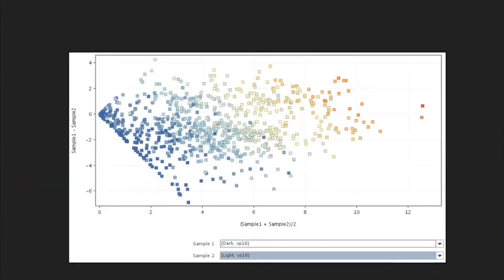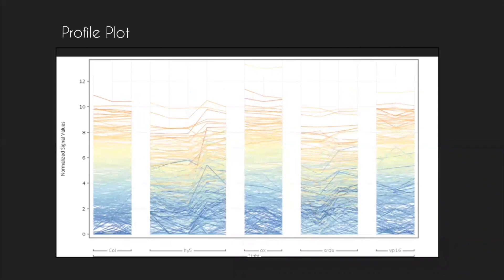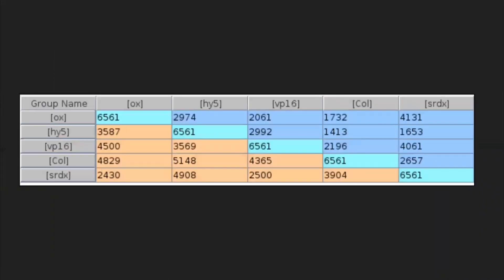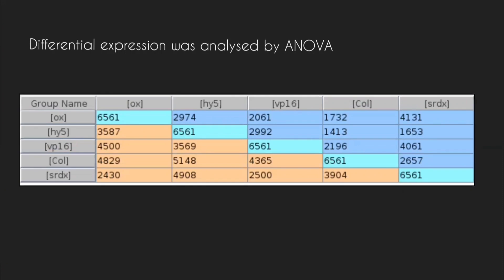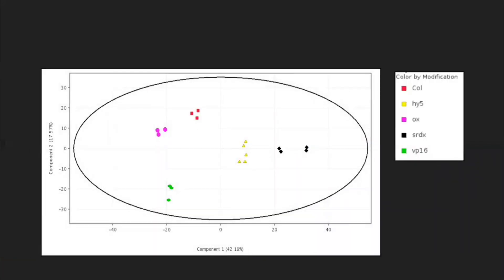Now we can visualize the gene expression of all genes in all samples by various plots — here is a scatter plot between two samples: dark-exposed and light-exposed plants with HY5 VP16, a box-whisker plot of samples, and a profile plot. Differential expression was analyzed by ANOVA; all conditions are compared to the HY5 mutant. 6,561 genes were found to be differentially expressed. A PCA and hierarchical clustering were done based on the genes in plants exposed to light, and here we are showing the PCA plot.